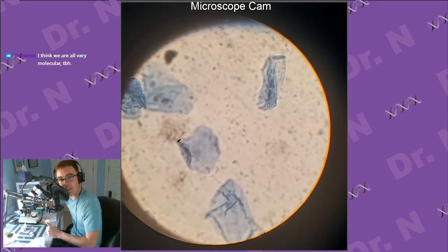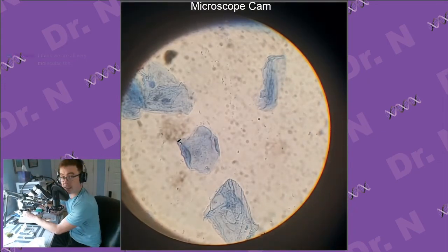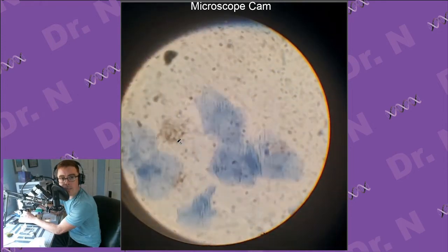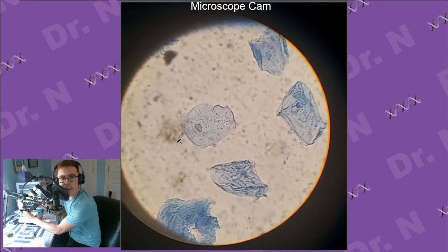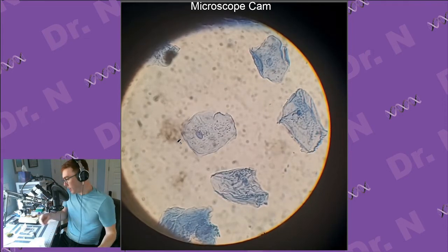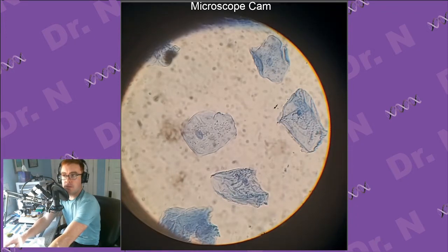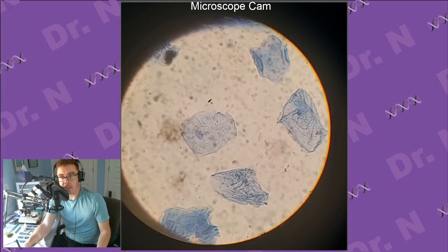Oh, wow. Here we go. Here's some cells. Nice. Okay. Oh, wow. These spread really nicely. Okay, this is beautiful. So what we're looking at are just epithelial cells. These are from the inside of my mouth.